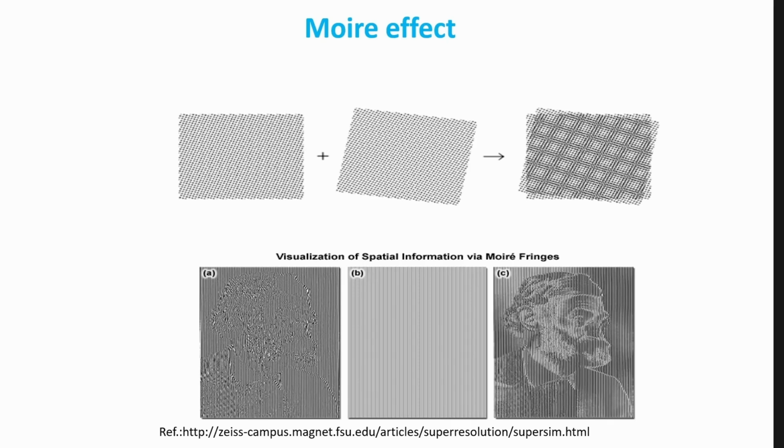A pattern field will give you a very strong Fourier transform peak at the spatial frequency of the pattern itself. The finer the pattern, the higher the frequency, the better the effect.